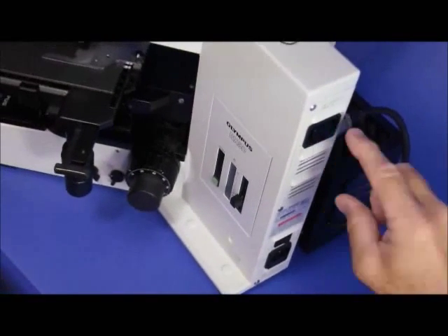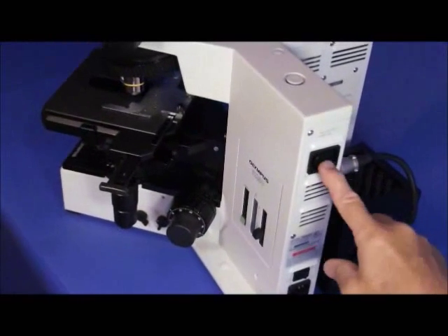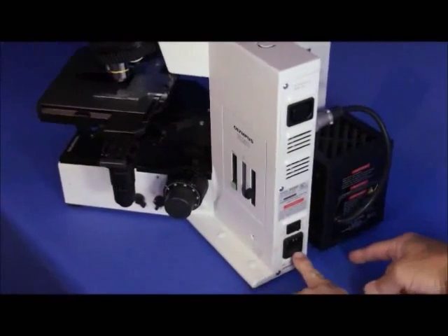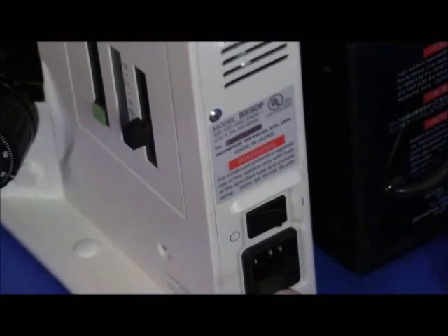There is an outlet for a dual viewer light arrow so that when you move the arrow around it's illuminated with this intensity because of this control right here. On and off and the outlet and you also have the fuse box right here. Easily accessible.